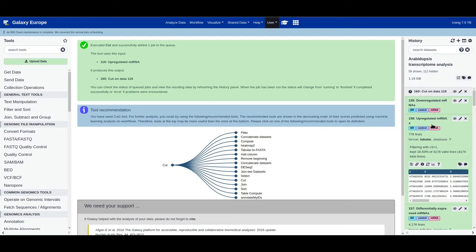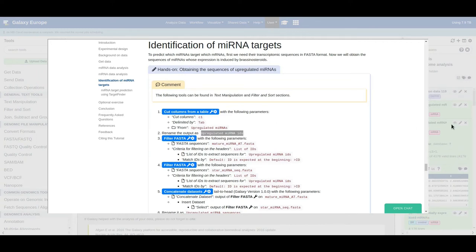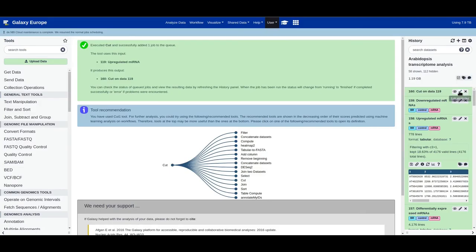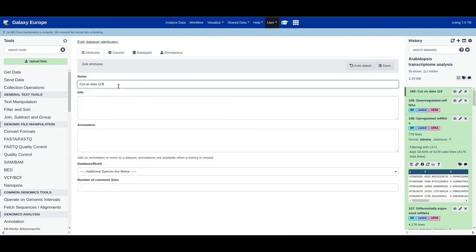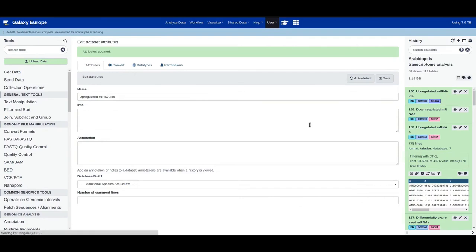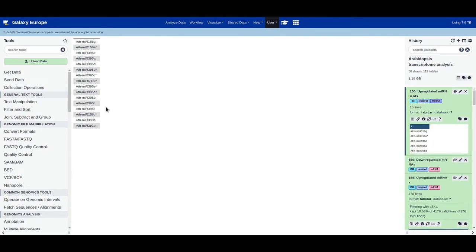Rename the output to 'upregulated microRNA IDs'. The job has finished. Inspecting the file, there are a total of 16 mature microRNAs and microRNA star sequence IDs. Now we filter for sequences using the filter FASTA tool — select the mature microRNA sequences FASTA file, and for filtering provide the list of IDs with upregulated microRNAs, matching by ID symbol followed by ID, then click execute.